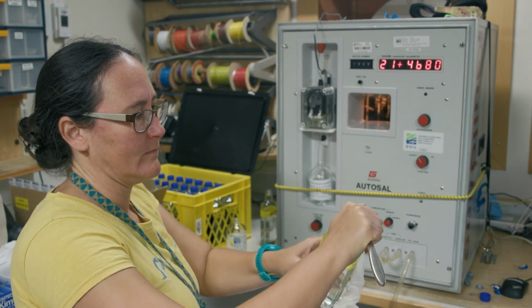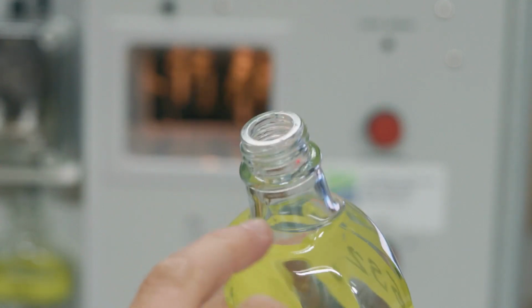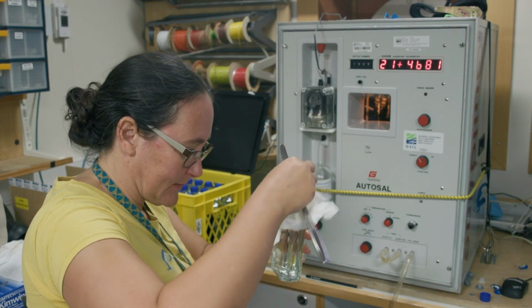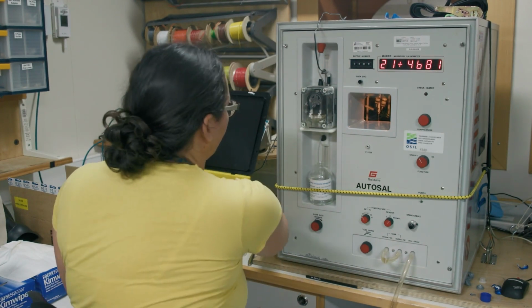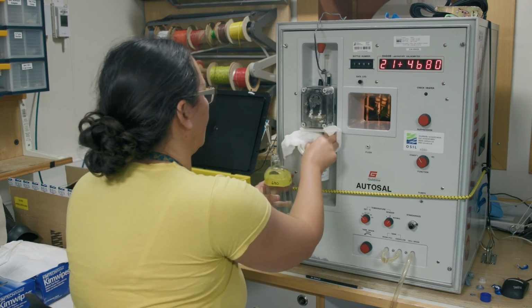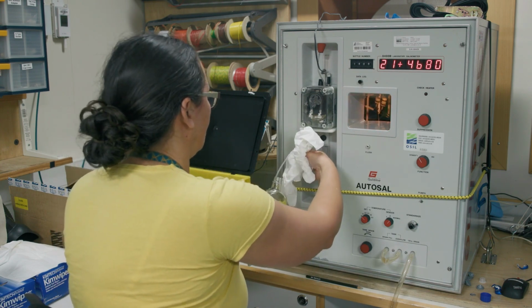Check the lip of the bottle once the insert is off to make sure there are no salt crystals, because knocking a single salt crystal into the water could significantly change the salinity. If there are any droplets or crystals on the outside, carefully pat them off. Now place the tube into the sample bottle, again using a piece of tissue to dry any droplets from the tube.